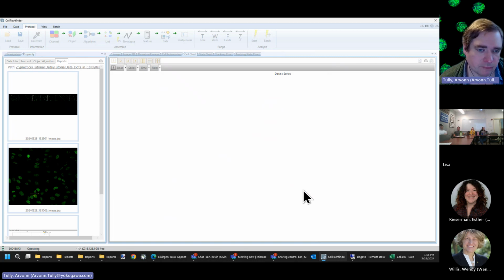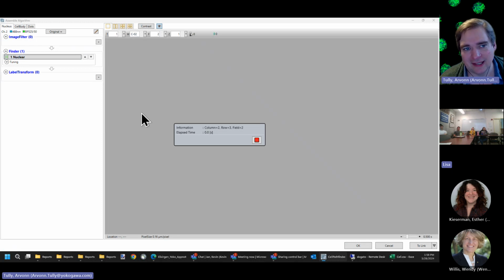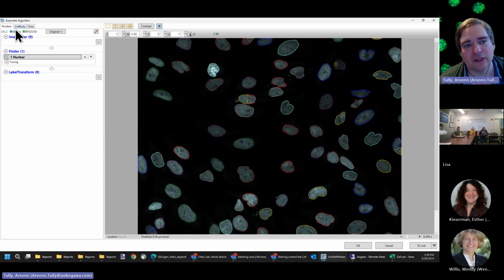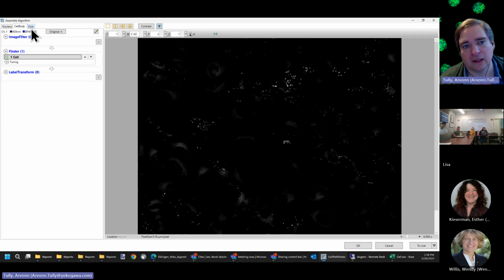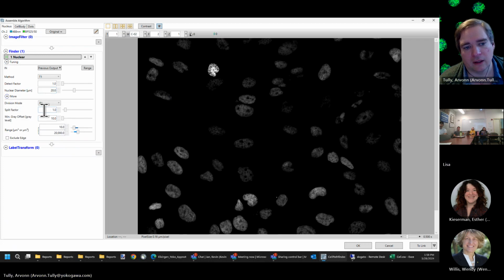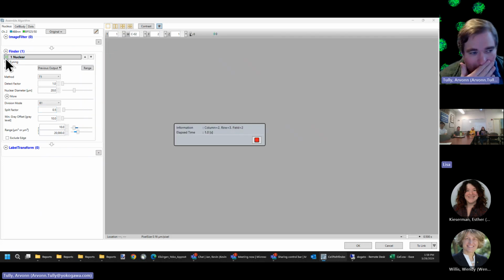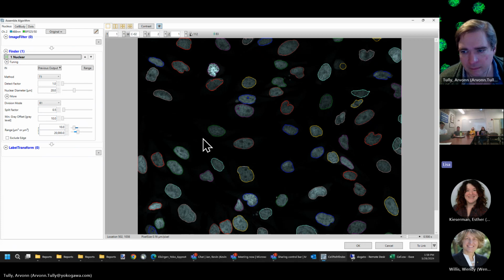So I'm going to go to algorithm. Oh my God, you've seen all this before. It's exactly the same. The difference is that up here we have nucleus, cell body, and dots. Okay, that's the difference. So I'm just going to go ahead and tune this like we did before, and just have a reduced split factor. 0.5. God, it just does it every time. There we go, 0.5. Comes out pretty reasonable. That's just miscellaneous objects outside the nucleus and the cell body.